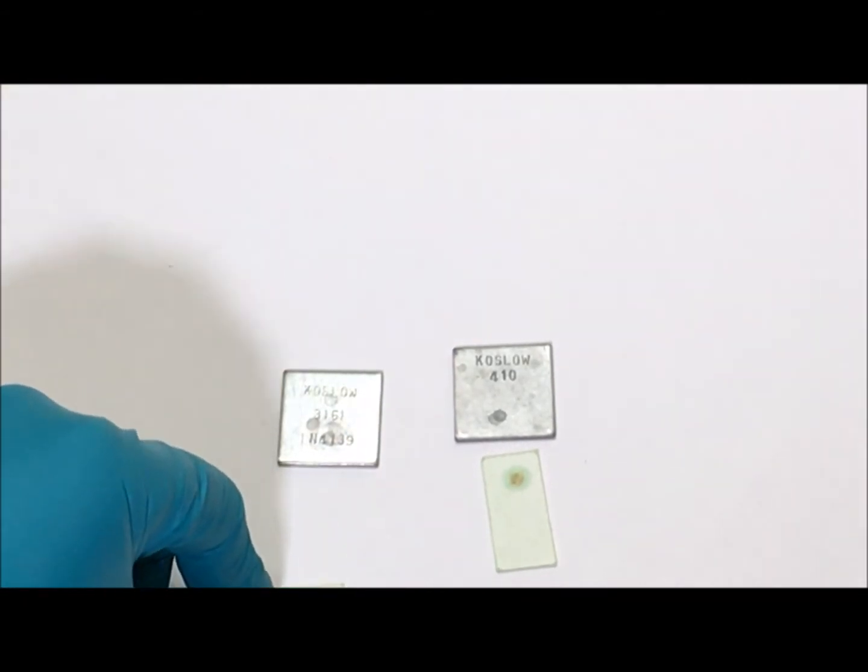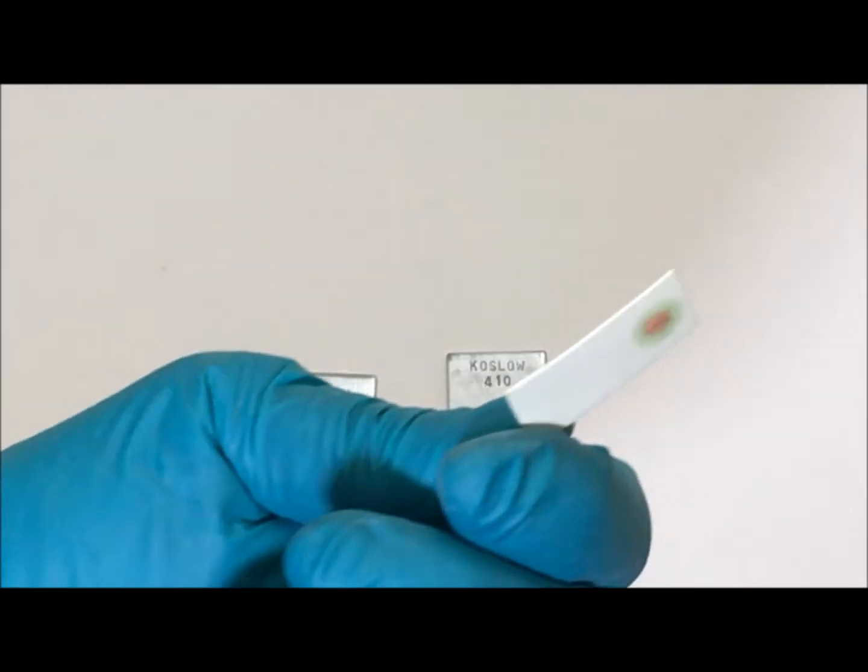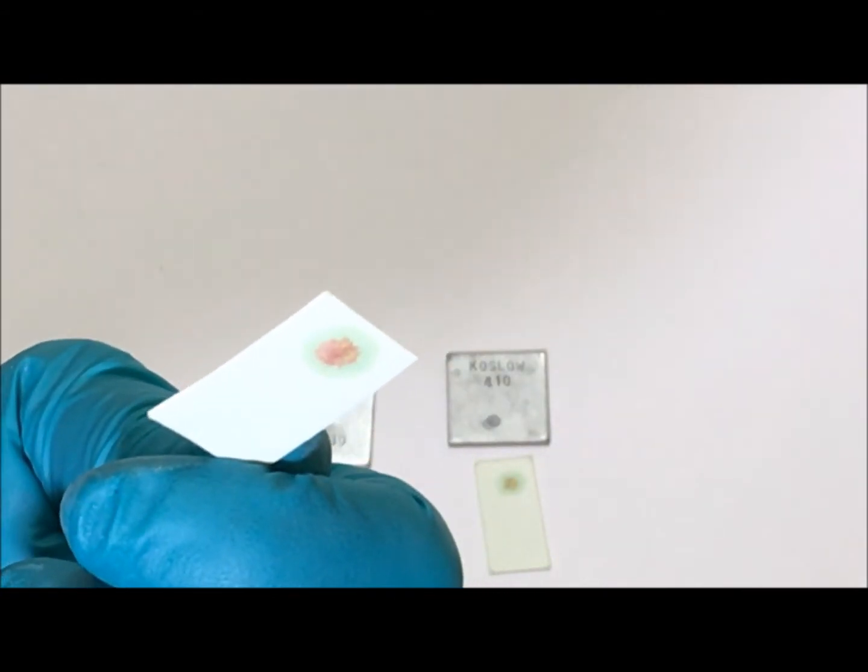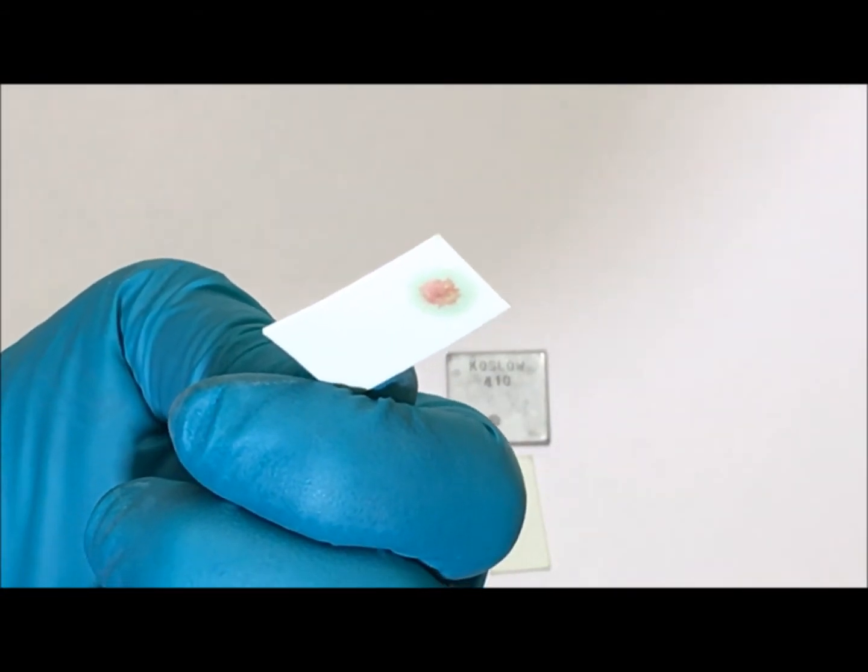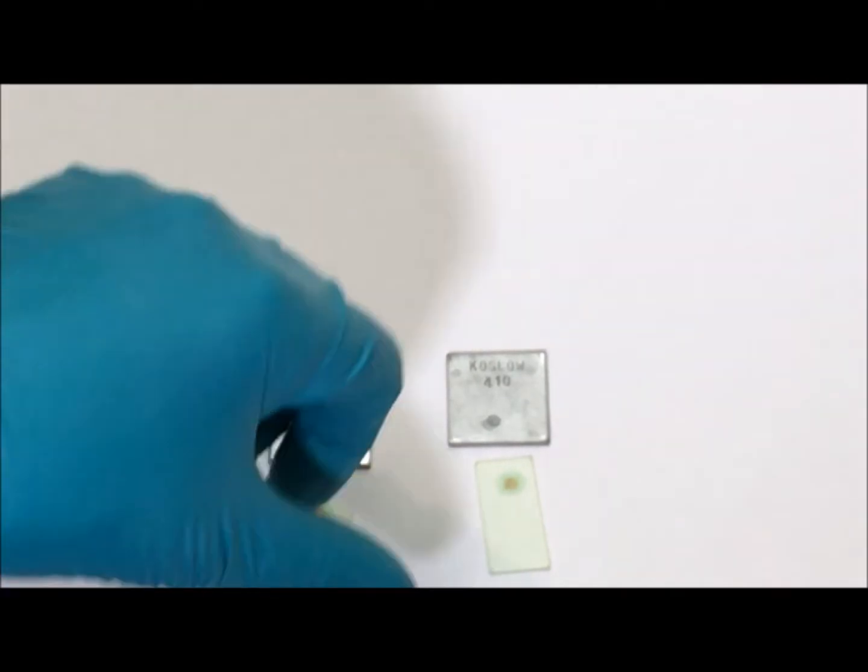Take a closer look, and the negative result.